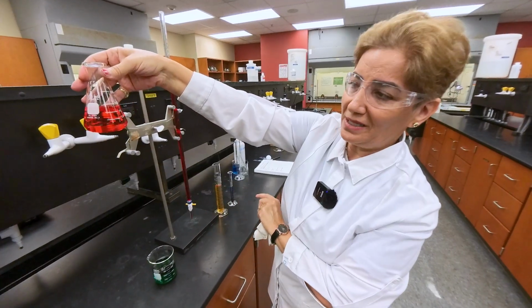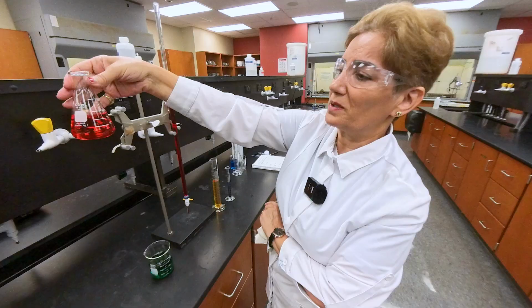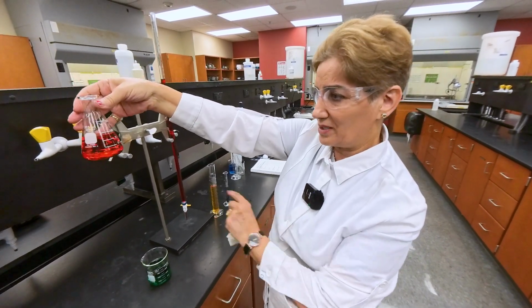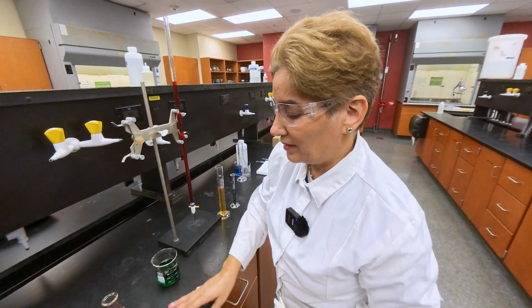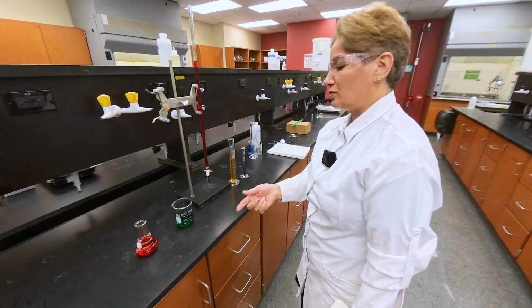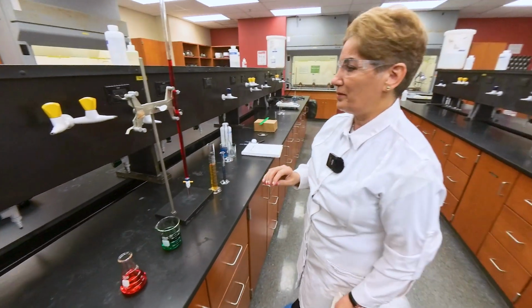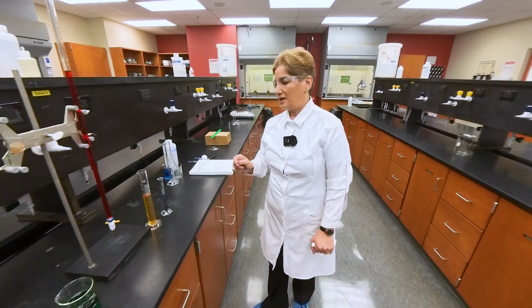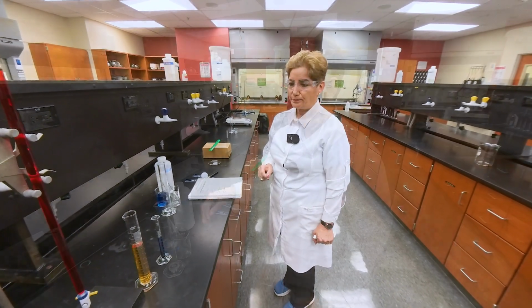You just have to estimate that it's between 75 and 100. If you tell me it's anywhere between like 85 and 95, I take that, because it's not an accurate reading regardless of how close you look at it, because it's not designed for measuring. So you're recording all these numbers with the proper number of decimal places, as accurate as possible, in the worksheet for part 2 of the experiment, part 2.1.